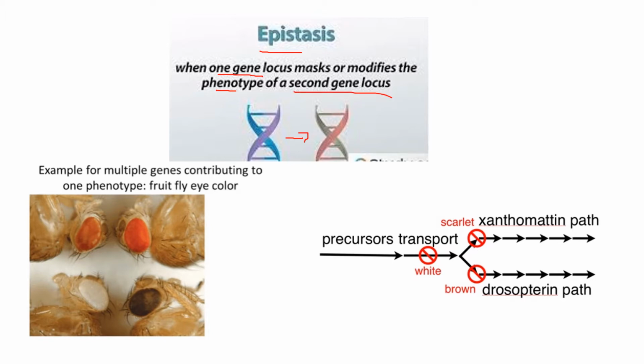Okay, so in this case, we're going to use chromatography that you already used in different labs, in cells energy or in diversity of life, as well as in chemistry. In addition to that, we're going to use fruit flies as a tool, and we're going to use a lot of mutations. And you will see the mutations that we have studied, like the ones that have white color, the ones that look like wild type, and some of them that have a reddish, and some that have a brown eye.